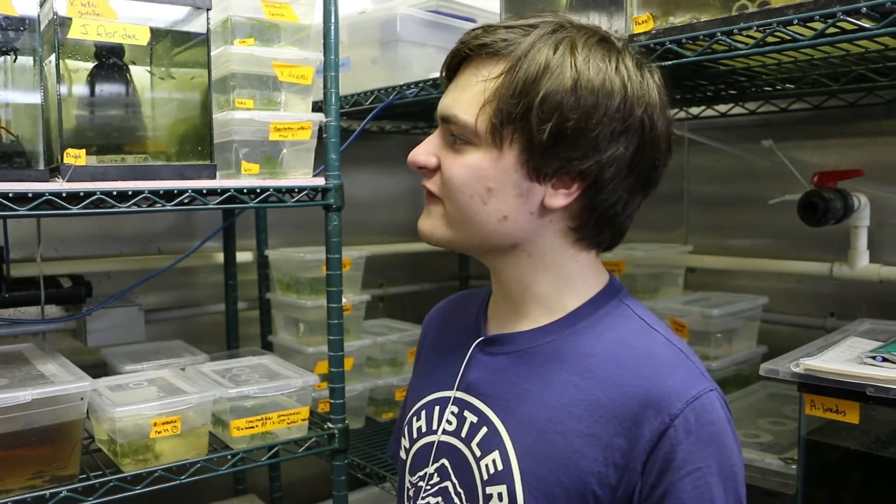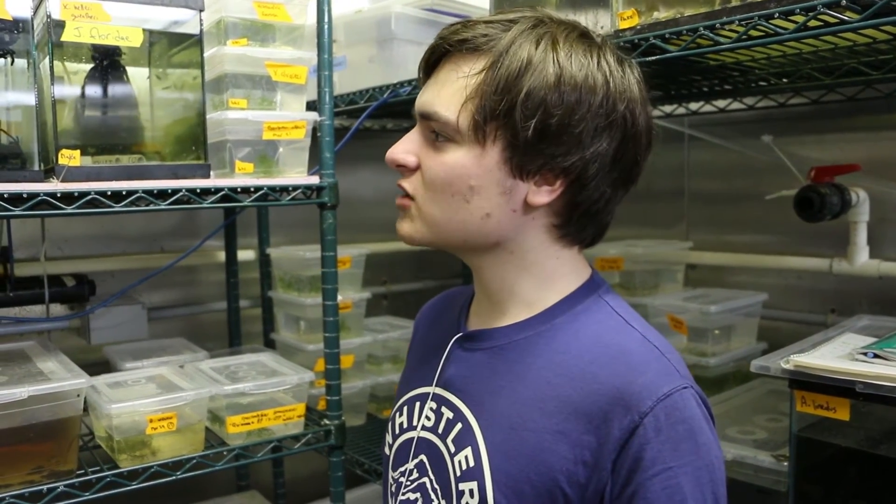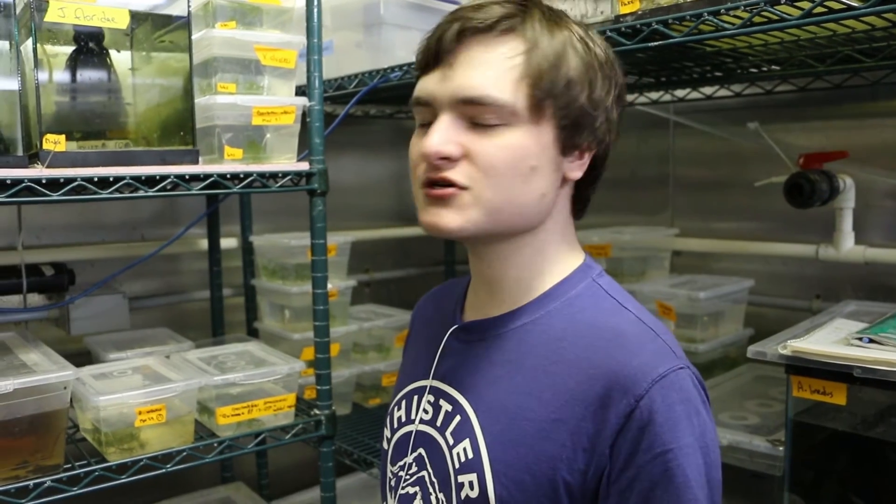So this is the killifish colony here at the University of Guelph. It belongs to Professor Pat Wright, and this is where most of the fish that I got tissue from to use in my research were raised.